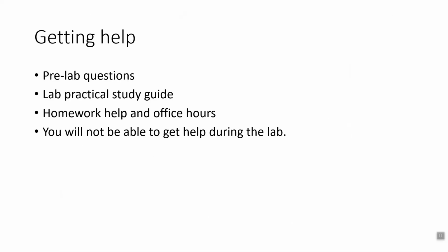Okay, so how about getting help? Well, getting help involves doing the pre-lab questions and making sure you not only know how to do the math, but also that you know how to actually make a solution once you've done the math. That's really, really important. Or you need to know how to actually do the titration practically. What goes in the burette, what goes in the flask, stuff like that. The pre-lab questions are more math-based to get you practicing the math, but think about the things you've done in the lab and how you're actually going to practically do that. I know you can do it, you just need to think about it because you've done it before.